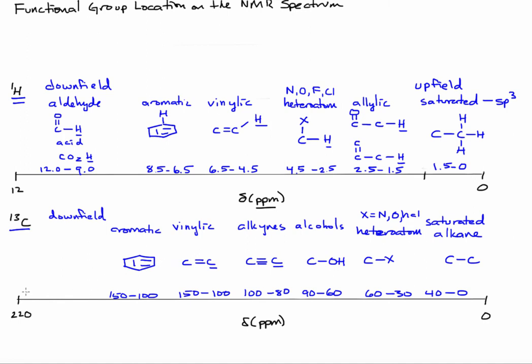And then finally the last region, the type of carbon that we're interested in is, say, 220 to 170. And these are the sp2 hybridized carbons of a carbonyl. You'll see some resolution between aldehydes, ketones, and esters in this region. But generally, this carbon falls in that region. You can then use corroborating evidence from the infrared spectrum to determine exactly what type of carbonyl that is.